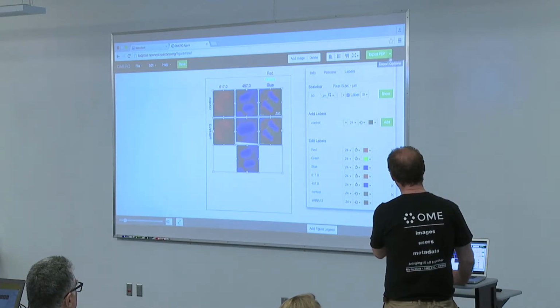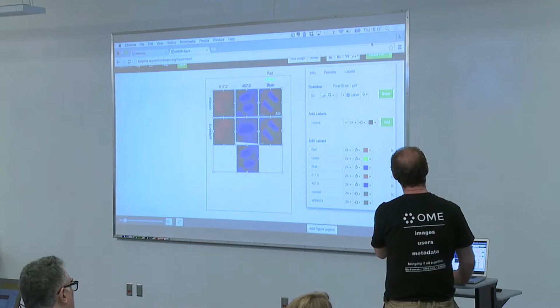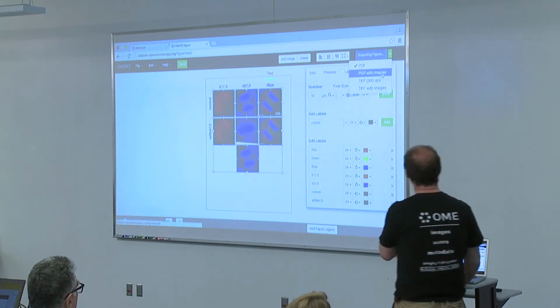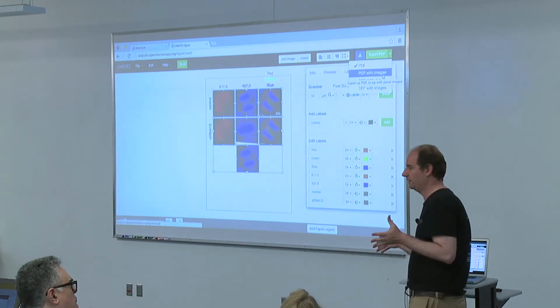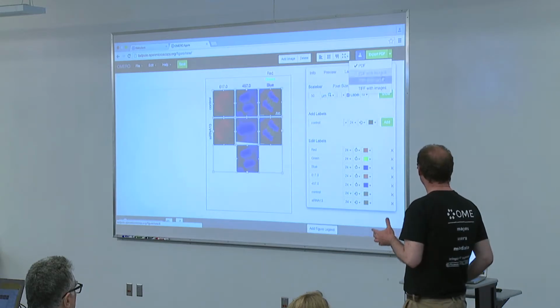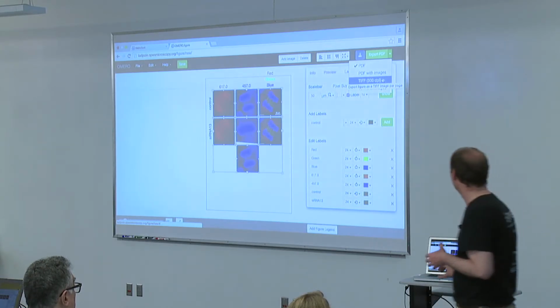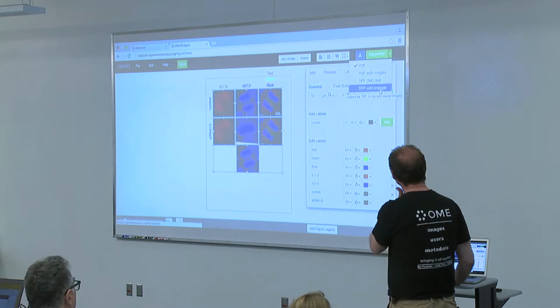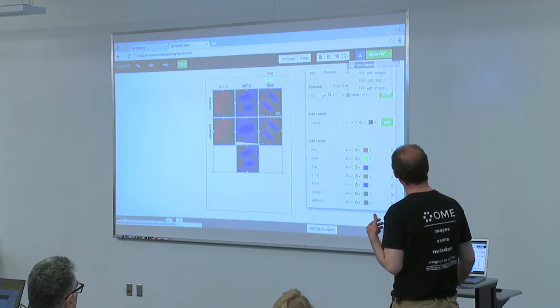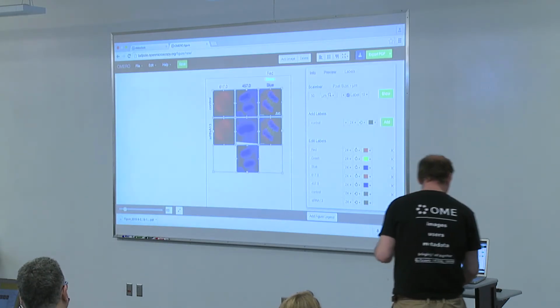And once you are happy with that, you can have a legend for the figure here. You can have a multi-paginated figure as well if you want. And let's have a look. What can you do in order to get the figure out because you want to publish somewhere? So you can export it as PDF with images, or as a TIFF. You can manipulate the DPI, which is very important for the demands of the journals. And you can again have all the images which are there. Now the figure is ready to go for me here. As I was talking, he was creating the PDF. I will download the figure to my laptop.